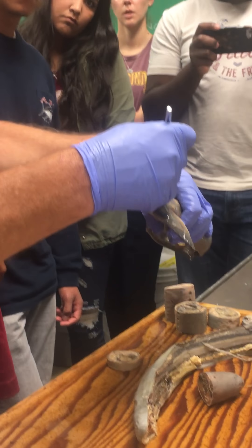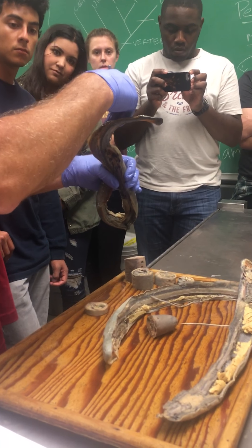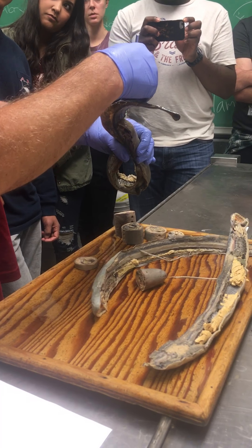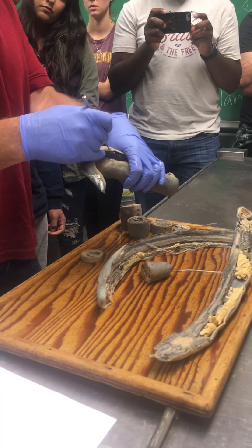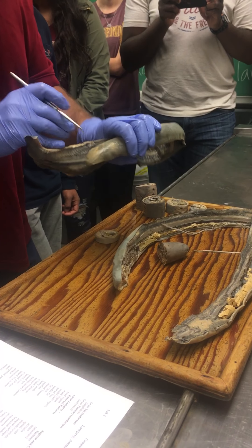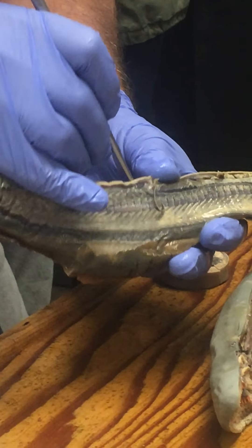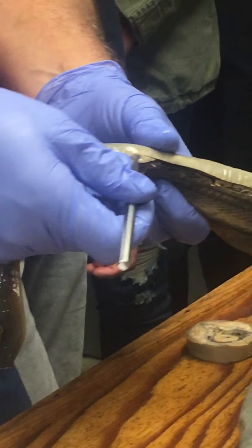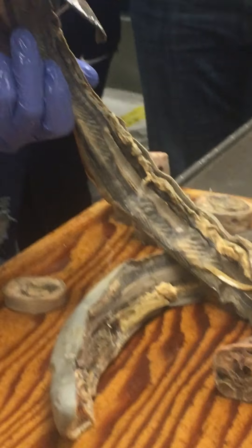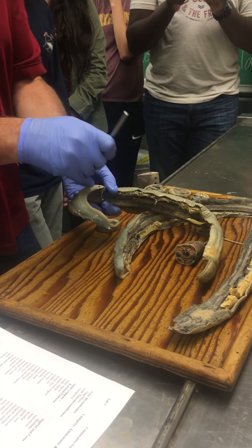That finger-like process would be the urogenital papilla — urinary and genital products, sperm in particular in the males, come out at the urogenital papilla. The anus is not coming out of the urogenital papilla; it's an opening in front of the urogenital papilla. You can extend the probe forward into it, and that's the end of the digestive tract.